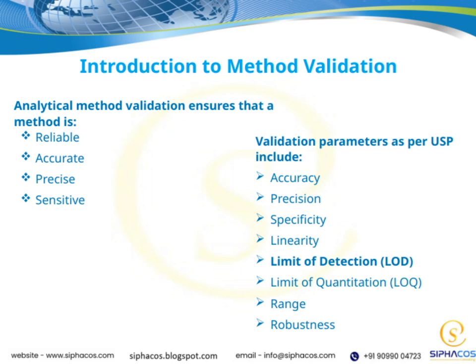These qualities are fundamental because they guarantee that our analytical results are trustworthy, supporting quality control and regulatory compliance. Ultimately, validation is about building confidence in our methods, so we can make informed decisions based on solid data.